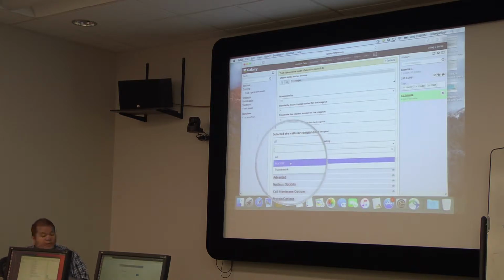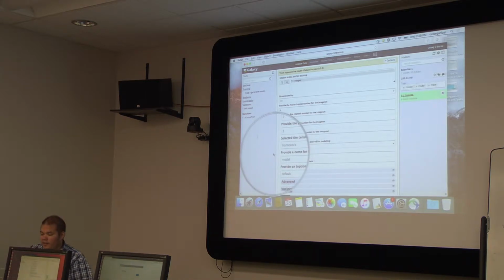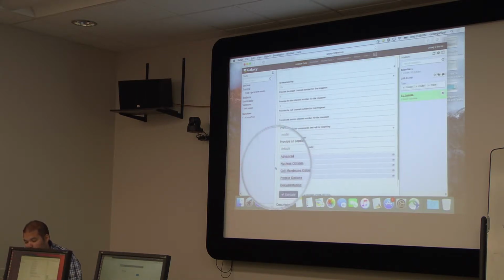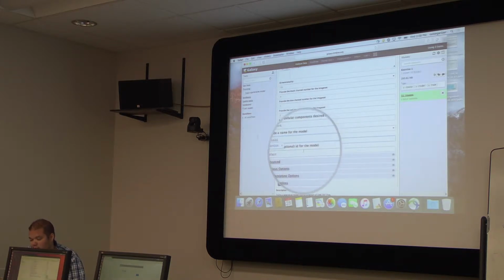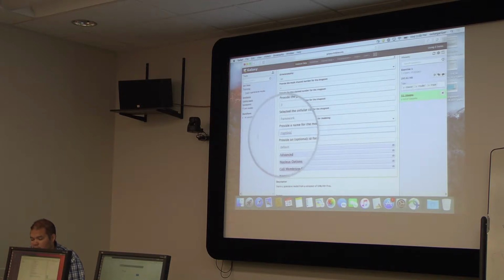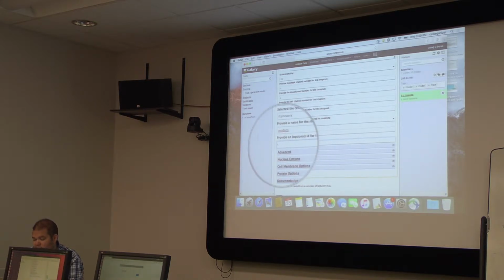We can either train a nuclear model, a framework model, or an all model, which is a way of saying nucleus, cell, and protein. And for now, we're only going to do framework because we want to do it relatively quickly. And provide a model name. I'm going to call it MMBioS. You can call it whatever you want. Provide a default ID. I'll say 1.